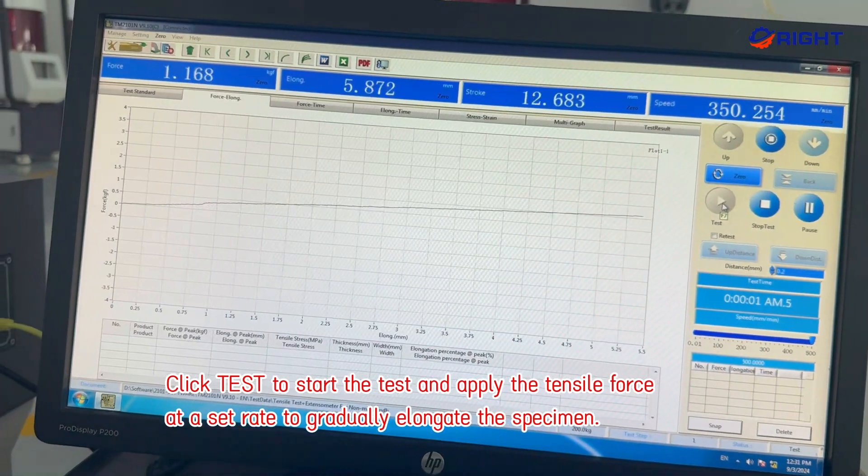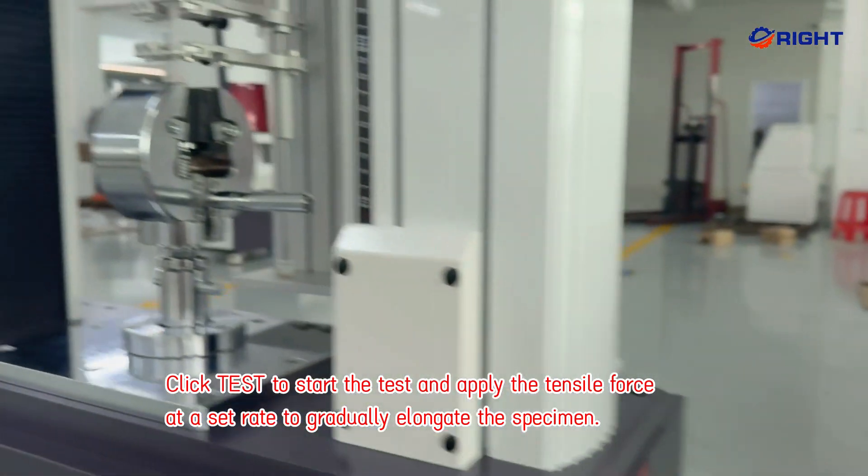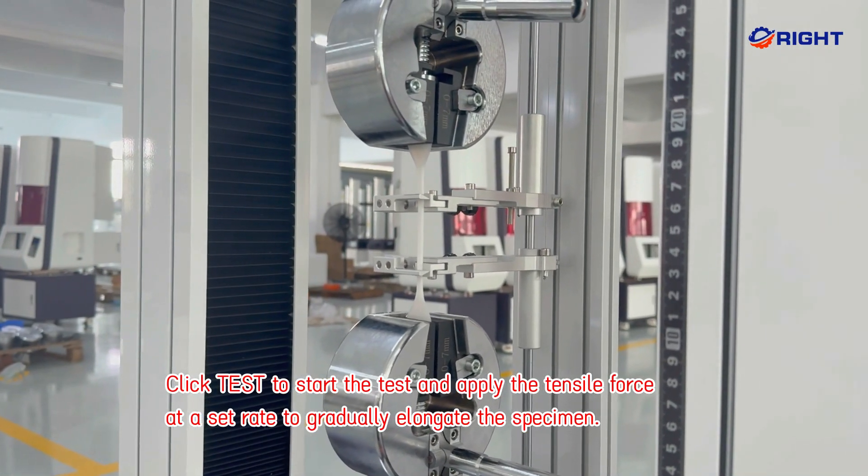Click test to start the test and apply the tensile force at a set rate to gradually elongate the specimen.